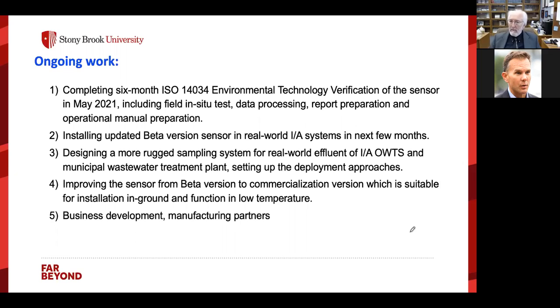So in this sensor design, the wastewater sample does not come into our detector probe. It's separate. That means all the matrix components, all the hydrated cations, anions, or organic matter, are separated from our signal. There's no interference from this kind of matrix. So this shows very high selectivity for nitrate and ammonium.